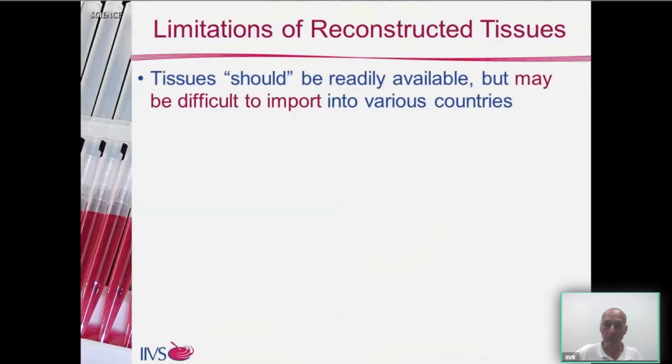And again, unfortunately, we always have to consider some of the limitations of all assay systems in particular, and the same holds true for reconstructed tissues. Tissues should be readily available, but we may have some challenges in importing some of these tissue models into various countries.